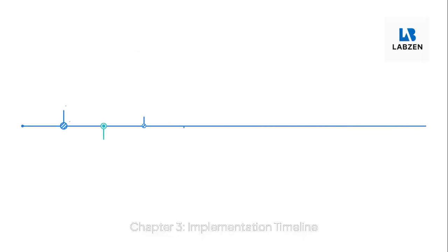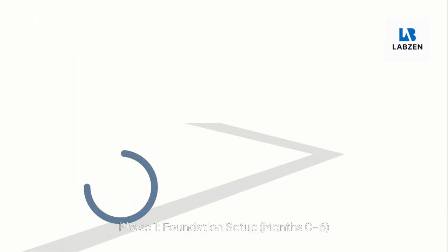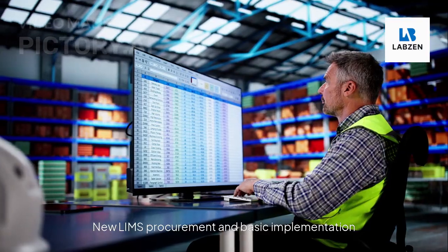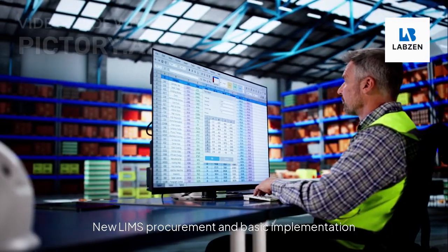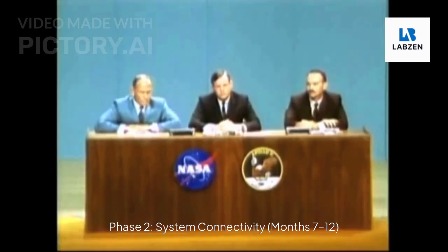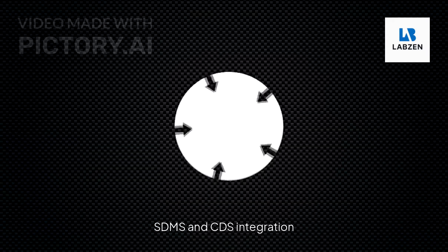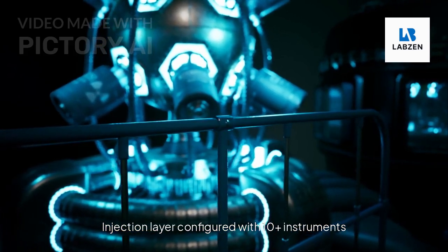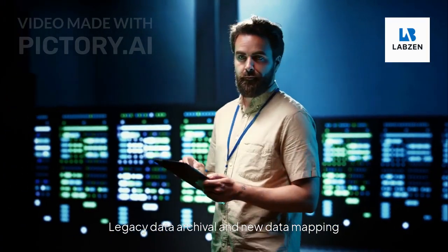Chapter 3: Implementation timeline. Phase 1: foundation setup, months 0 to 6. SOP harmonization, URS development. New LIMS procurement and basic implementation. Instrument inventory, classification, and connectivity roadmap. Phase 2: system connectivity, months 7 to 12. SDMS and CDS integration. Ingestion layer configured with 10 plus instruments. Legacy data archival and new data mapping.